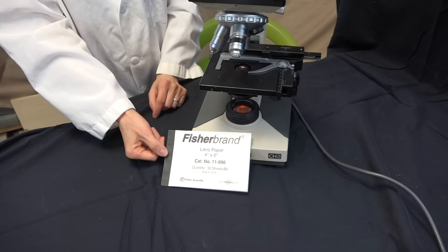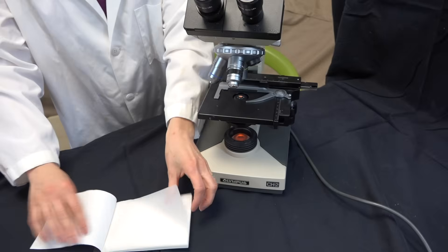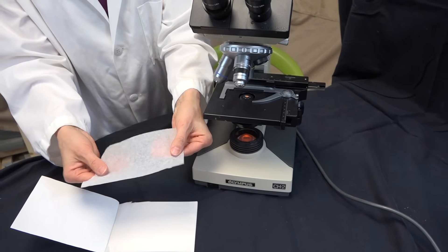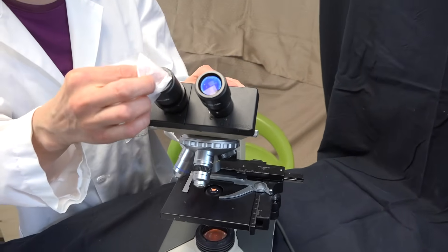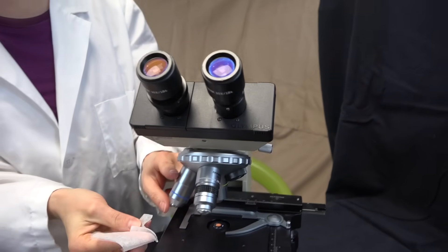When you're finished using the microscope make sure that you clean it. To clean it you will use lens paper. Remove a sheet of lens paper and you can wipe off the oculars and you can also wipe off the objectives.